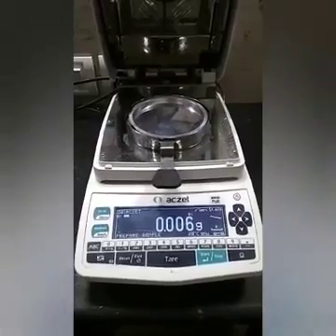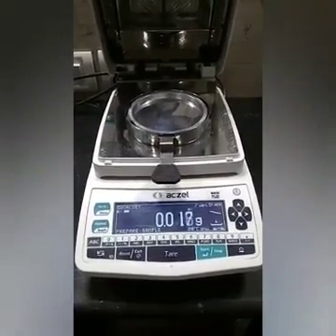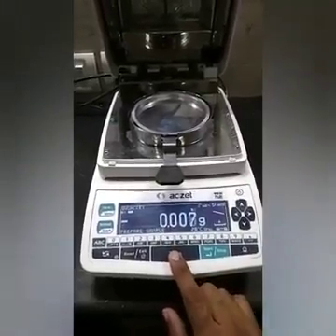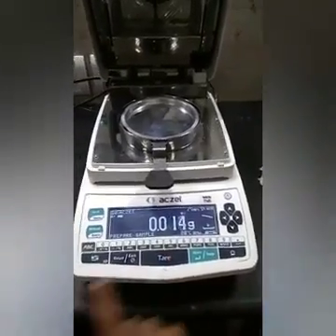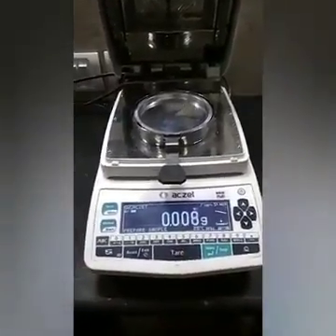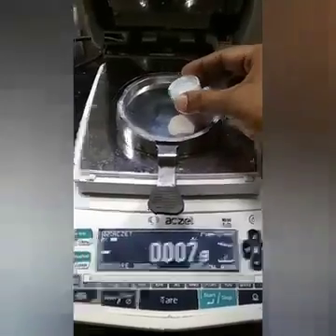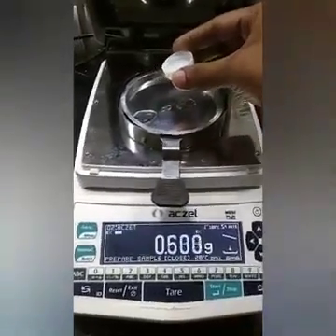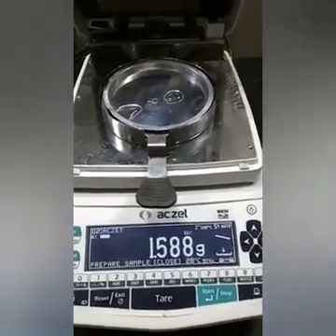For example, I am showing a sample of water, which will show exactly 100% moisture. The reading is not stable right now because the AC is on. I am putting around one to one and a half grams of water for this demonstration.